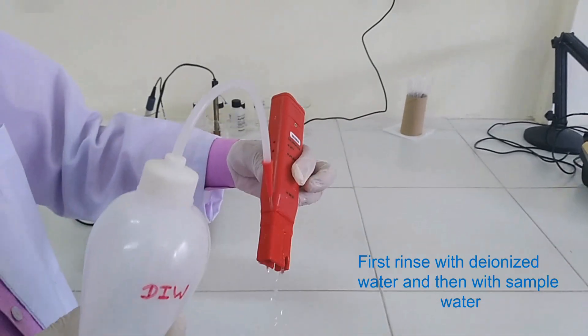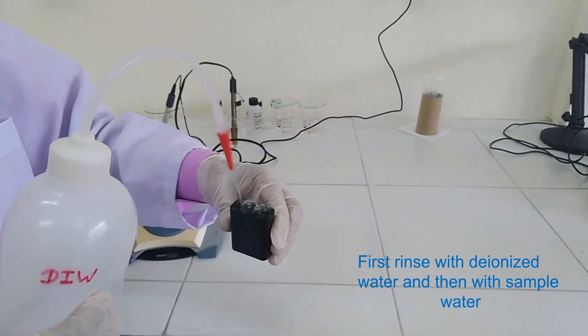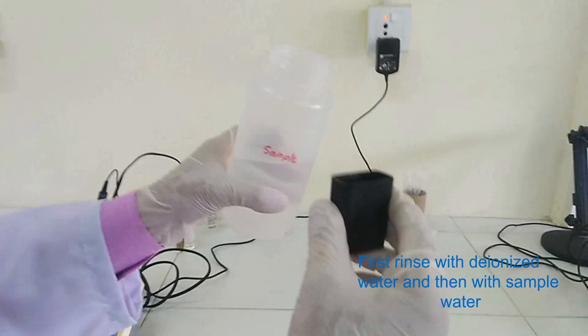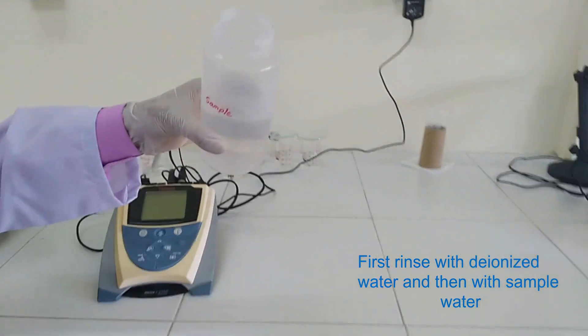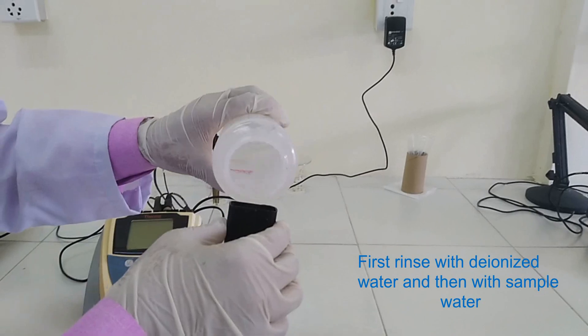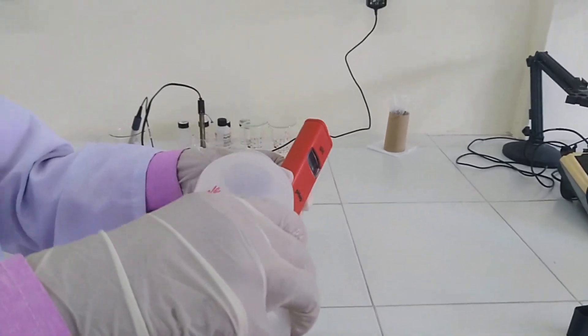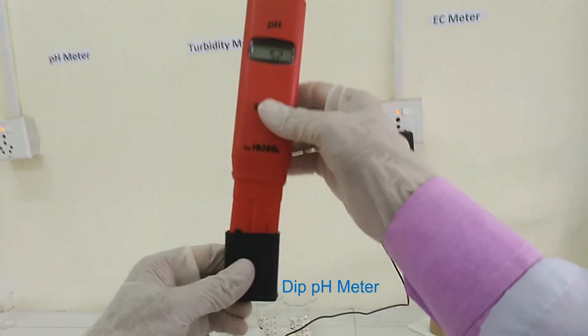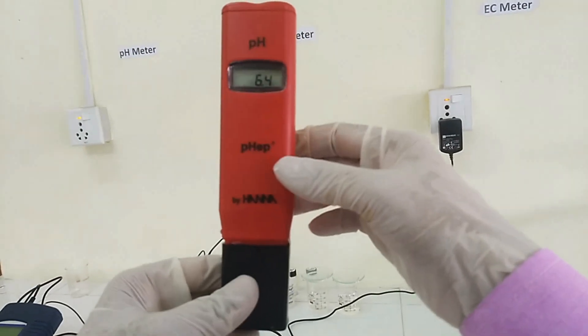After calibration, switch off the instrument first. Then to measure the pH of water sample, first rinse pH meter and cap properly by deionized water and then rinse with sample water. Take water sample in cap and dip the pH meter. Wait for a stable value.